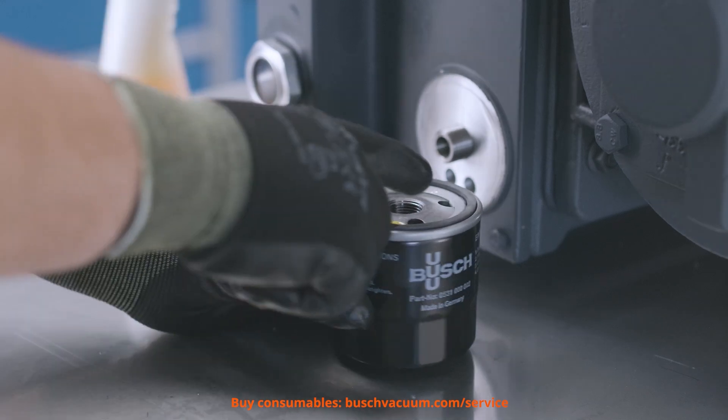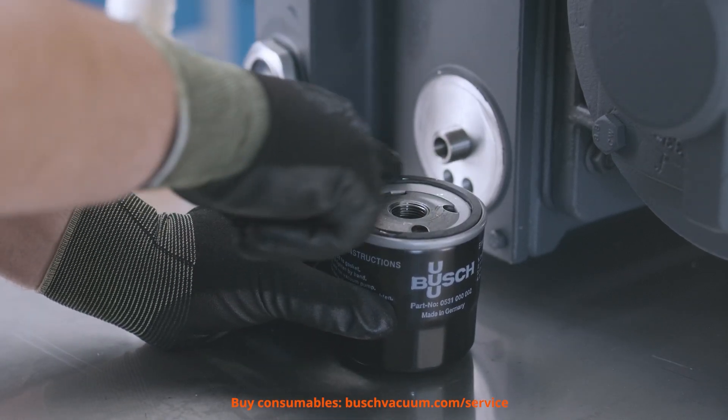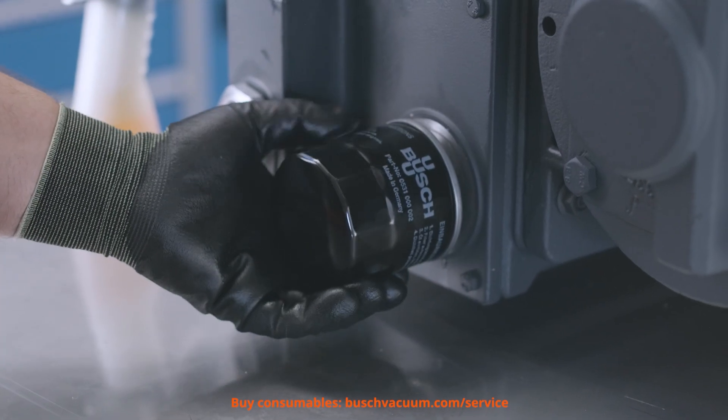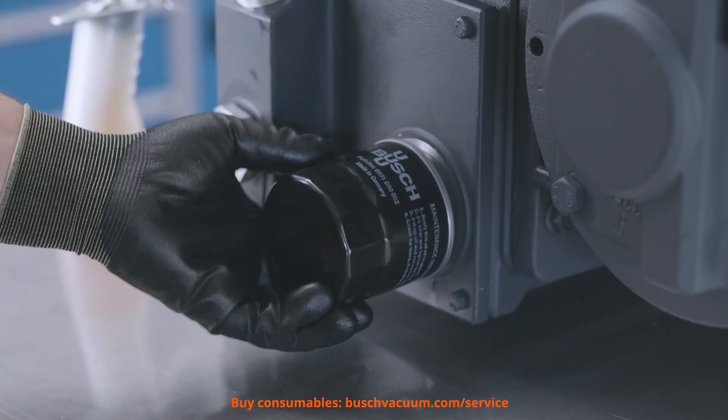The new oil filter gasket has to be lubricated before its first use. Then we have to screw the filter firmly back in.